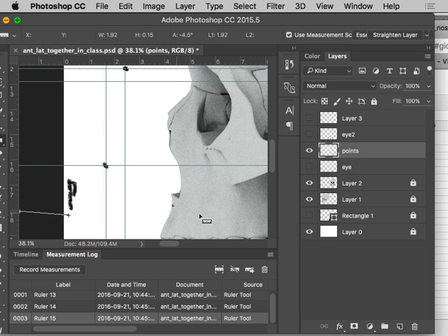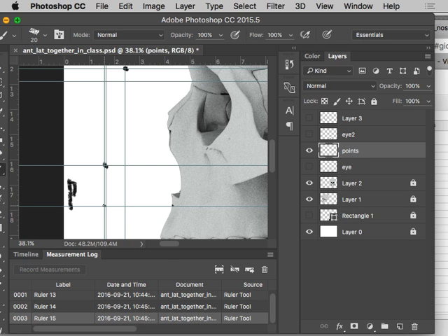Oops. Unfortunately, undo doesn't work with the measure tool. So we're going to have something like this. And so we get something that's largely on the same plane here. Sometimes it's not. Sometimes you get a point that is slightly different. And that's the information I don't know how to deal with in his measurement sometimes.